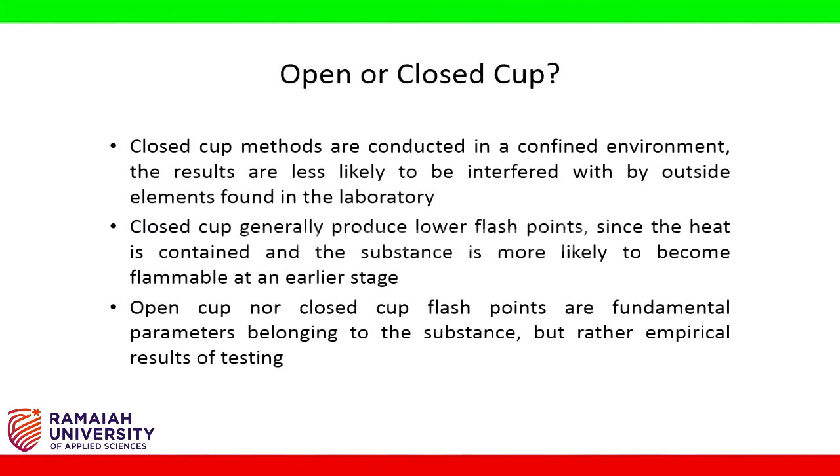Open or closed cup? Closed cup methods are conducted in a confined environment. The results are less likely to be interfered with by outside elements found in the laboratory. Closed cup generally produces lower flash points since the heat is contained and the substance is more likely to become flammable at an earlier stage. Neither open cup nor closed cup flash points are fundamental parameters belonging to the substance, but rather empirical results of testing.